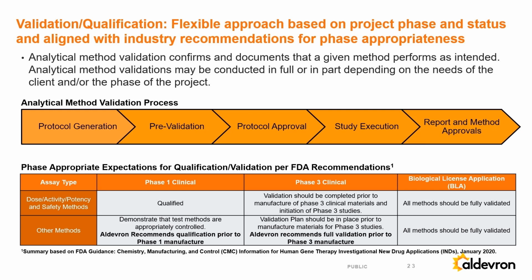The one thing I will say is that, in order to leverage more of these product-specific qualifications, having platform validated methods where appropriate makes a lot of sense, and that is something we tend to do. We are able to do that when we have the expertise and the experience manufacturing the product, and we have a data set where we can set proper validation criteria.